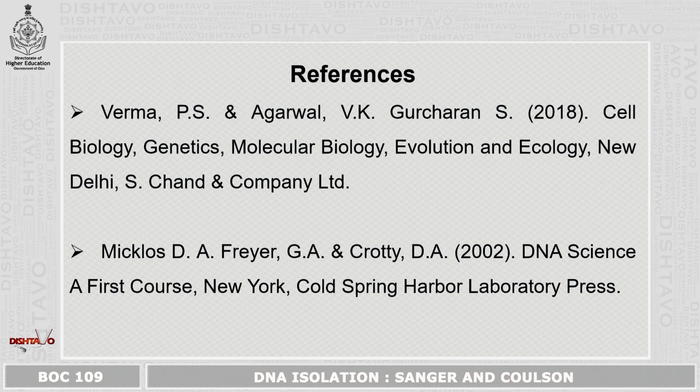So students, you have understood Sanger's method of sequencing, which utilizes dideoxynucleotides to terminate and get the fragments and then read the sequence by autoradiogram.